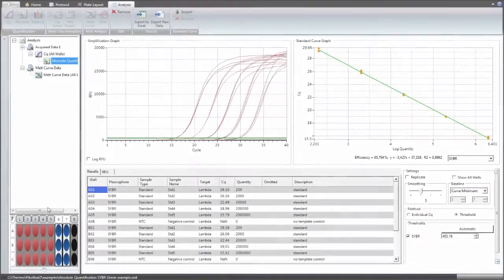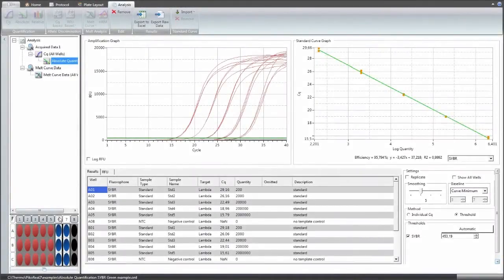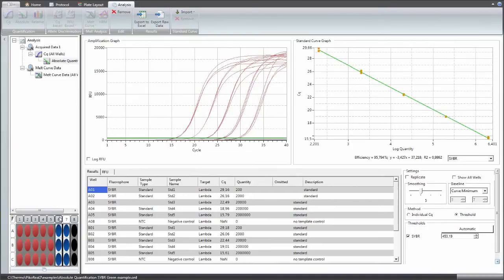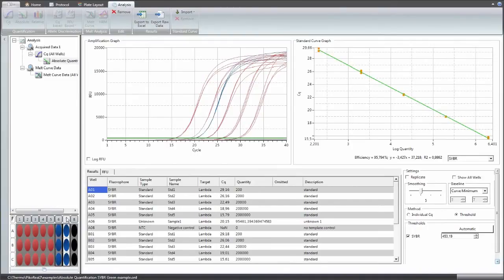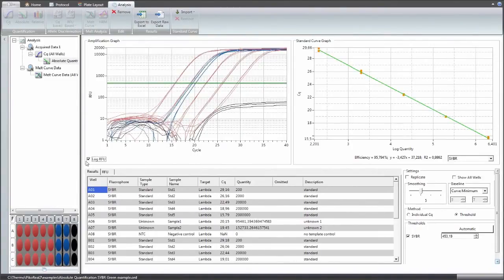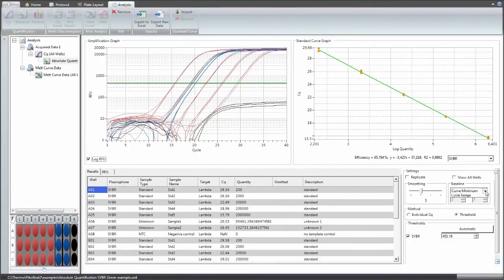In the analysis view, both sample data and settings are placed on the same page. This way, the effect of parameter changes can be seen instantly.